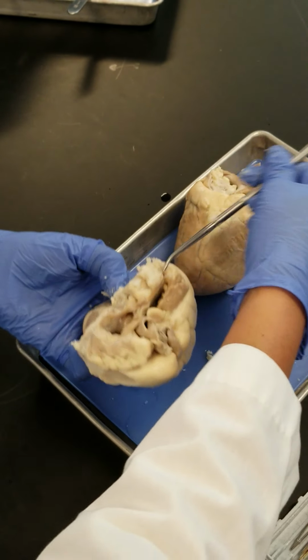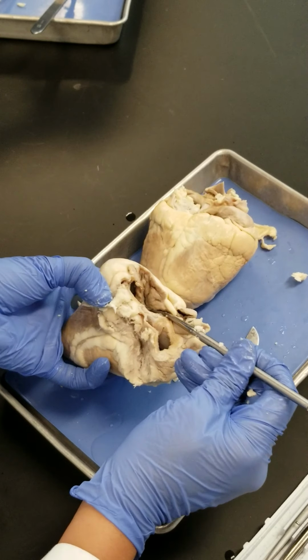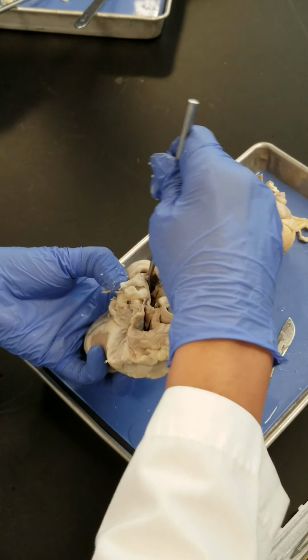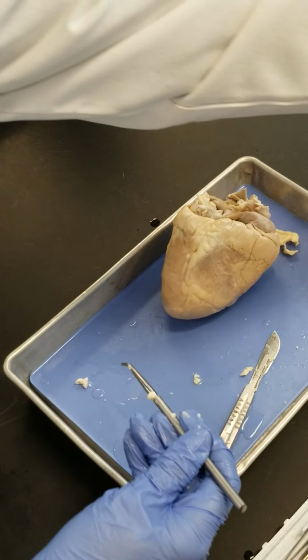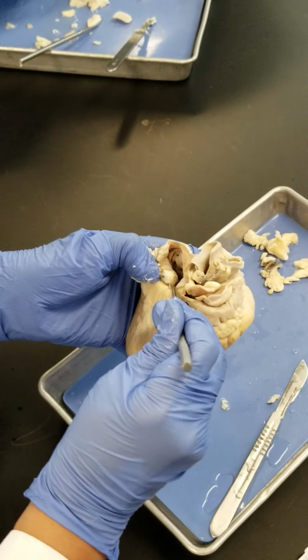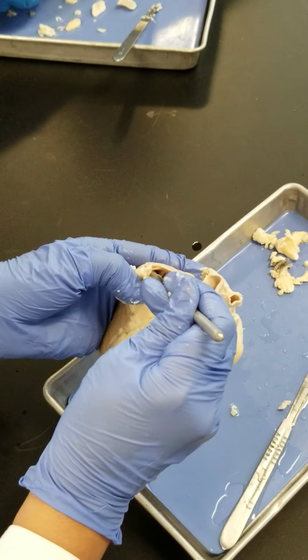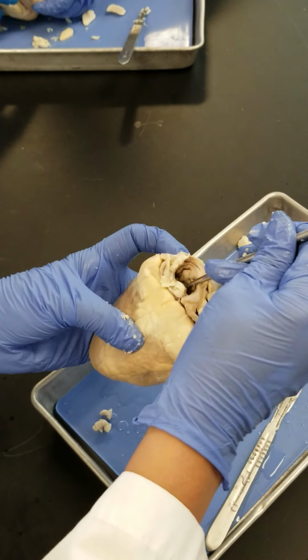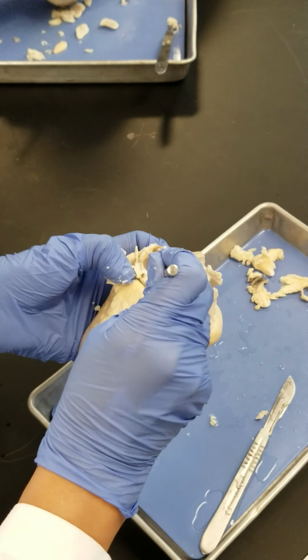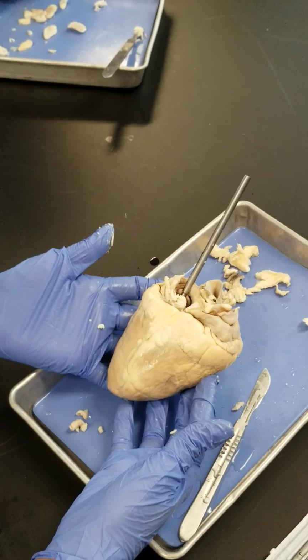Very cool, right? So, as you see here, you have the impressions of all the locations of the pulmonaries. Two on this side, two on the other side, but you don't have the vessels themselves. Let's see what do we have here. So here you don't have the vessels, you have the whole chamber, the left atrium, with the four pulmonary veins going into that one, right? Good? And take a picture.